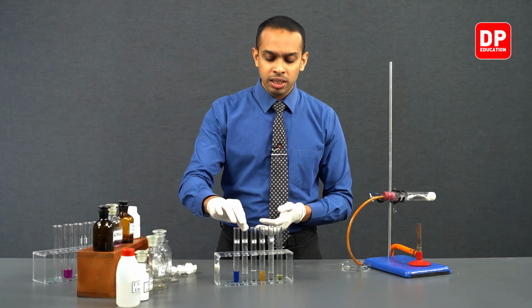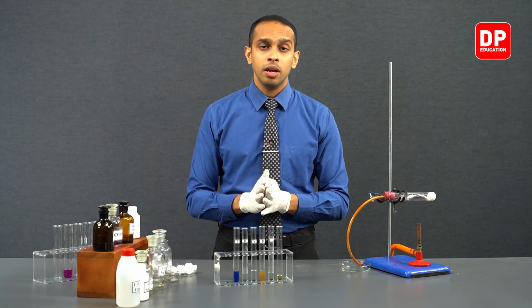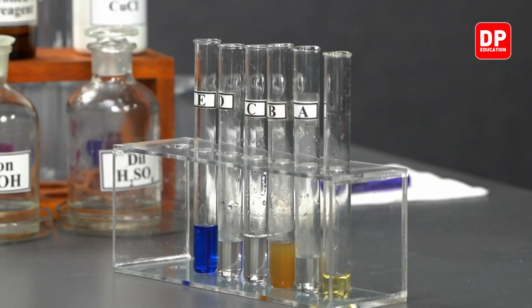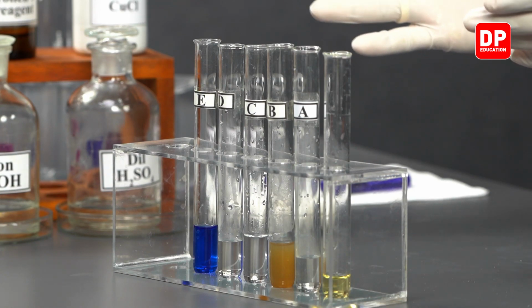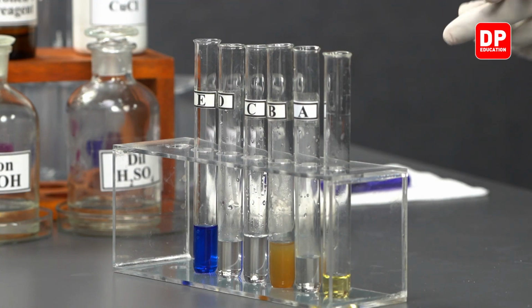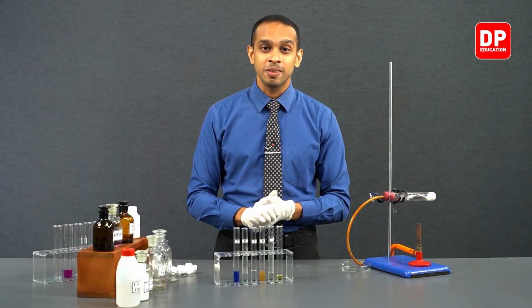And test tubes D and E did not show reaction, because the alkene that we have here, which is ethene, does not react with ammoniacal silver nitrate or ammoniacal cuprous chloride. However, alkynes will react with both of these.